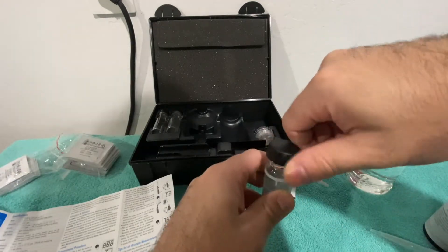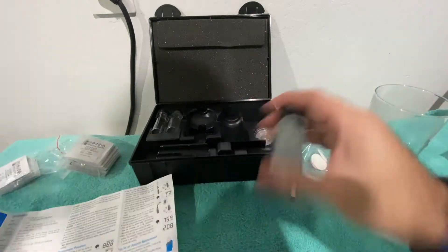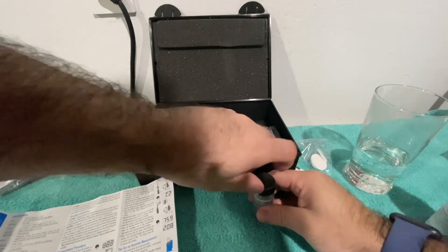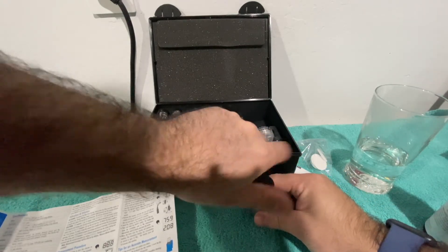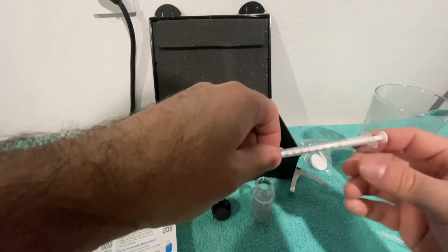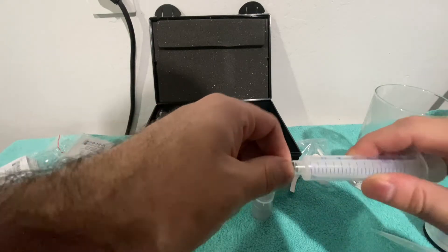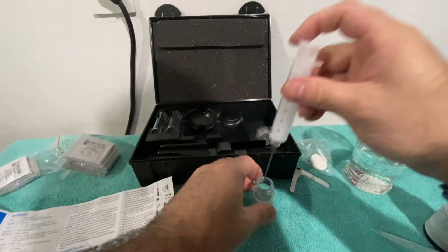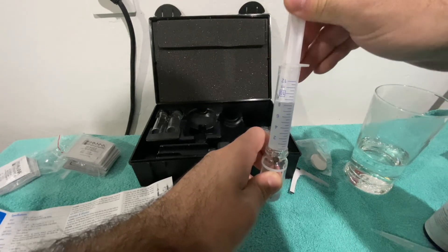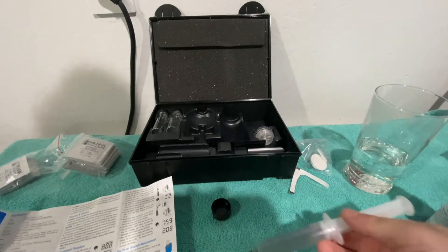After you've put the B packet in, put the cap back on and shake for one minute. Once you've shaken it for one minute, remove the cap and thread the needle that comes on the smaller syringe onto the larger syringe — it just twists on. Then draw the liquid out.